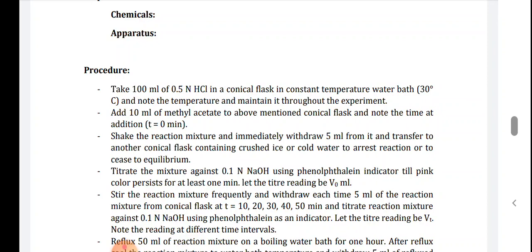For the procedure, first take 100 ml of 0.5 normal HCl in a conical flask in a constant temperature water bath maintained at 30 degrees centigrade. Note this temperature and maintain it throughout the experiment. Next, add 10 ml of methyl acetate to the conical flask containing 100 ml of 0.5 normal HCl. Note the time at addition — this is zero time.